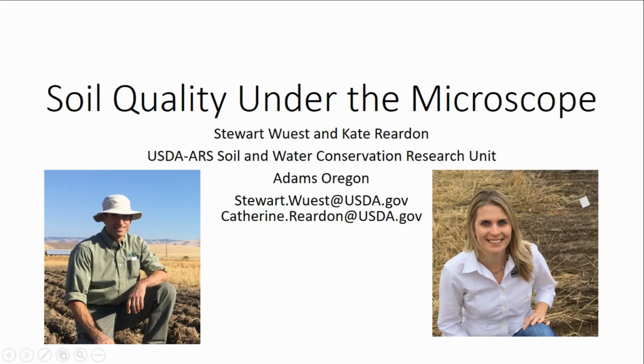We're going to take a look at soil quality from a microscopic perspective. My name is Stewart Wuest, and I'm a soil scientist with the USDA ARS Soil and Water Conservation Research Unit in Adams, Oregon. And my colleague who took my photos for me is Catherine Reardon, who's a soil microbiologist at the same unit.